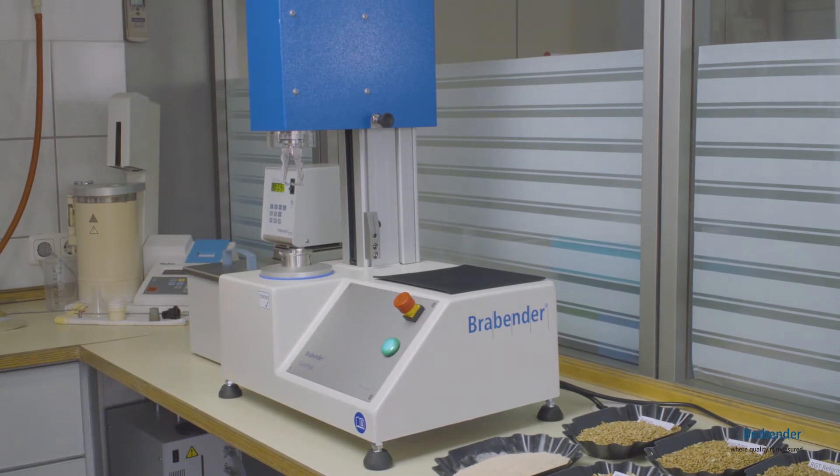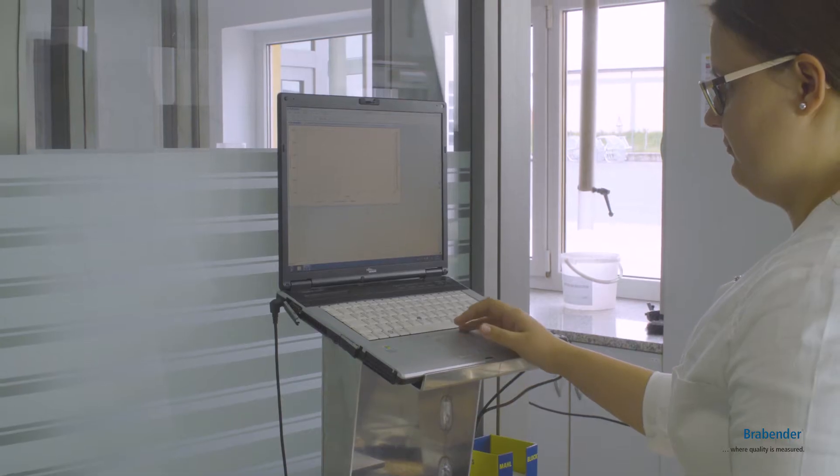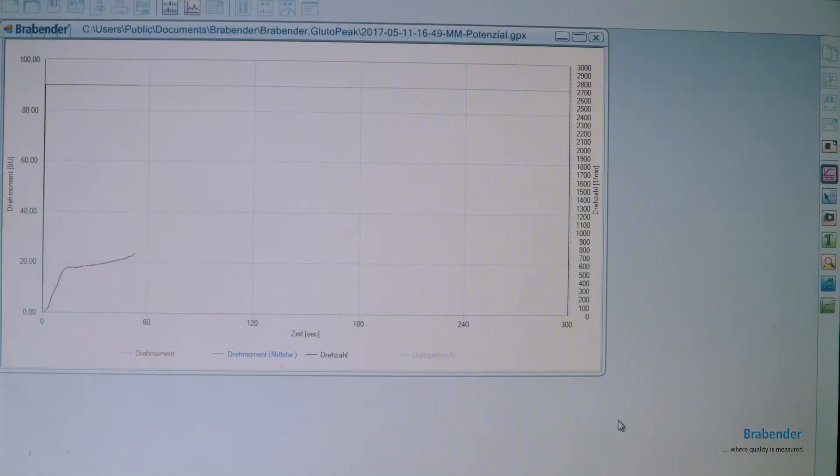The change in consistency of the sample is measured as a torsional moment and portrayed graphically as a curve, resulting in a rheological fingerprint of the analyzed flour. This allows conclusions about the glutinous quality and its specific functionalities.